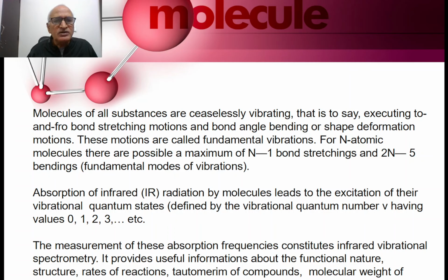Absorption of infrared radiation by molecules leads to the excitation of their vibrational quantum states. These quantum states are defined by the vibrational quantum number, symbol small v, having integral values 0, 1, 2, 3, etc. The measurement of these absorption frequencies constitutes infrared vibrational spectrometry.